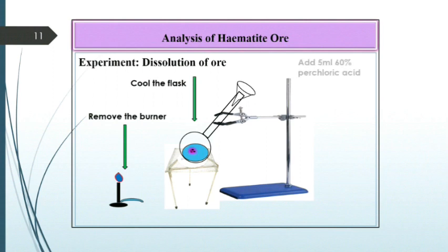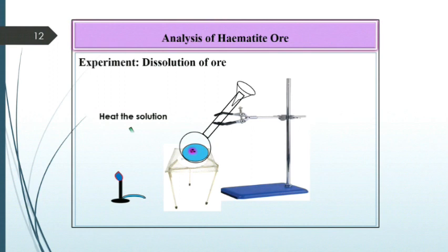Then add 5 ml of 60% perchloric acid to the same solution. Now heat the solution again till white dense fumes start evolving.